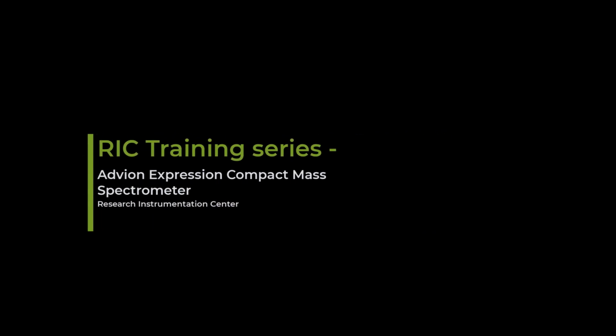This is the training video for Advion Expression Compact Mass Spectrometer in Research Instrumentation Center. The Advion Expression Compact Mass Spectrometer is a single quadrupole mass spectrometer with atmospheric pressure ionization sources capable of analyzing polar and mildly polar compounds at relatively low concentrations.